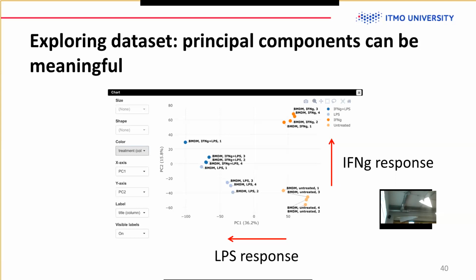Then after stimulation, the samples get activated in more or less the same direction, but one goes one way and the other somewhat differently. Again, this sort of thing is pretty easy to tell from a PCA plot and to reason about in terms of a PCA plot. Here everything seems to be labeled fine and consistent, which is great.